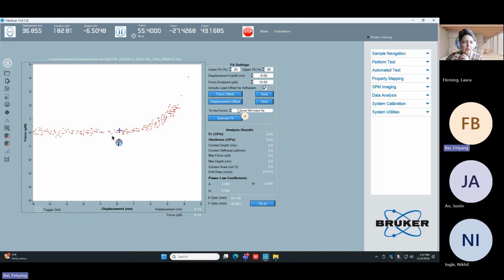Okay. So open the others? So now we did 4 already, or earlier we did 5? We did 4, and then it moved to 5 because that's the next one in the directory. Okay. But we're not going to do anything with this data. This was just for demonstration purposes of re-zeroing manually. We're going to go back and reuse that data that we re-zeroed in batch.